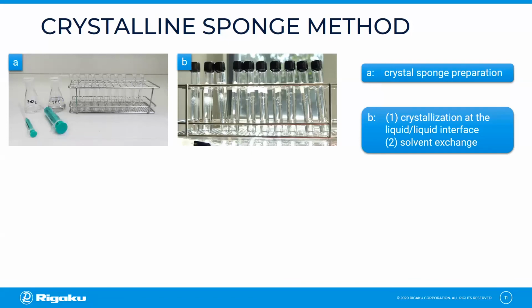Here you can see a rack of different crystallization attempts. Depending on how carefully you layer the solutions on top of each other, the produced crystals will be many small or very few big ones, as on the right. Like for most single crystal diffraction experiments, the crystals should roughly exhibit a size of 100 to 150 micrometers. The crystallization is usually completed after 2 to 3 days. Then the crystals are combined in one test tube and the solvent mixture is gradually exchanged to 100% of weakly binding solvents like cyclohexane.